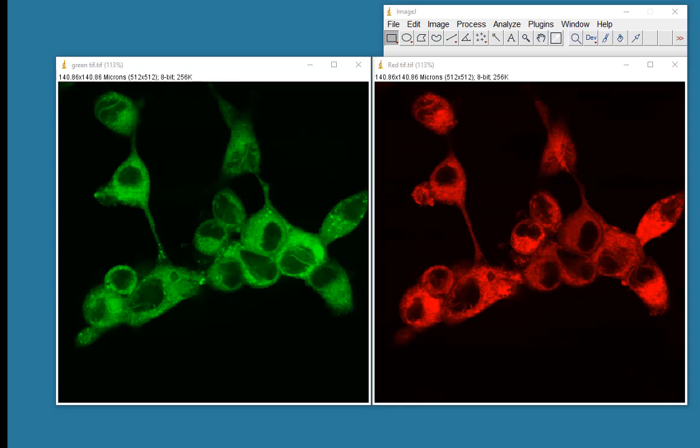They're fairly equal intensity images, and when you have two images that are similar in intensity, then you could do a red-green overlap and measure the amount of yellow, because green plus red gives you yellow, and if both signals are similar, then you'll get a yellow color.